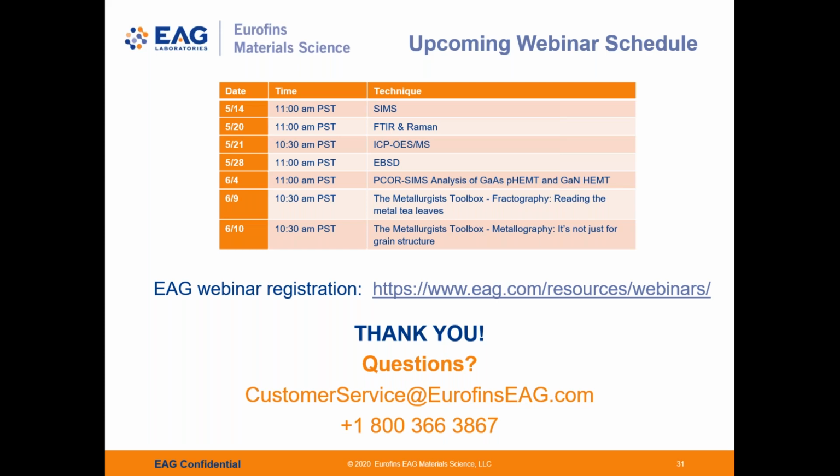Another question we have here is, does RBS cover ppm level detection for all the elements or a few elements? What can it detect at ppm level, or what else can we do with this? The heaviest elements certainly can be quantified in ppm terms. We're talking about elements like tungsten, gold, lead, bismuth, platinum.